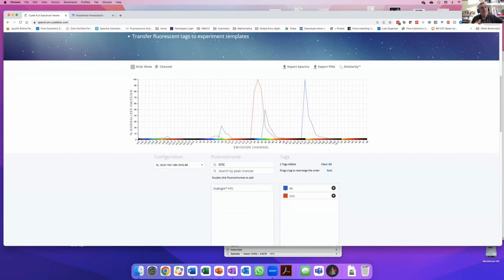You'd think, well, surely 100% ethanol is better, right? 100's got to be better than 70. But that little bit of water that you dilute it in actually helps get the ethanol into all the phases of the cell, all the lipids within the cell. If you go below 60, then you don't get as good a fixation, so that will affect the CV of the data. So there is a little bit of leeway, but I would keep it relatively close to 70%. Also, with fixation, particularly with ethanol, or any fixation, you should use cold fixative, because fixation is an exothermic reaction. We don't want to boil our cells, so we should always have cold fixative.